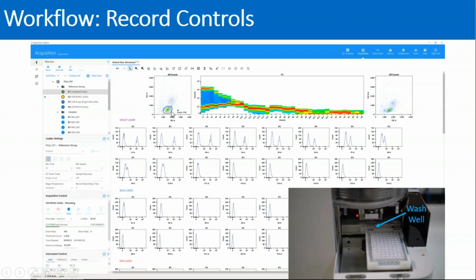And in this worksheet, I've got a gate on my lymphocytes, which is displayed on these nice spectrum plots in the worksheet. And as you can see in my lymphocyte population, I've got 2 different spectra going on here. I've got one from events expressing the positive BV421 signal, and I've got another beneath it, which is the natural autofluorescence in that unstained sample that's part of the mixture.